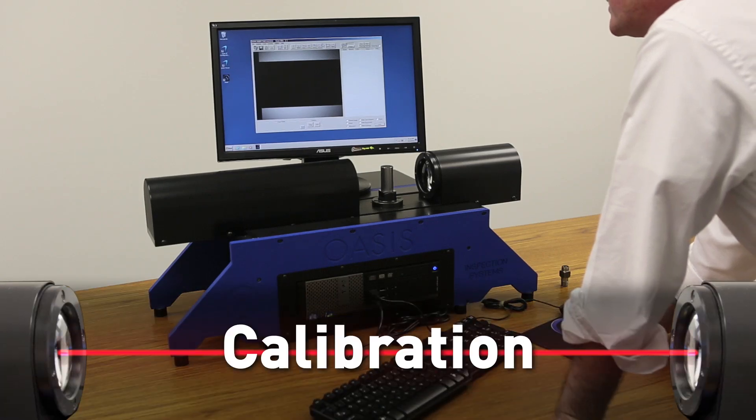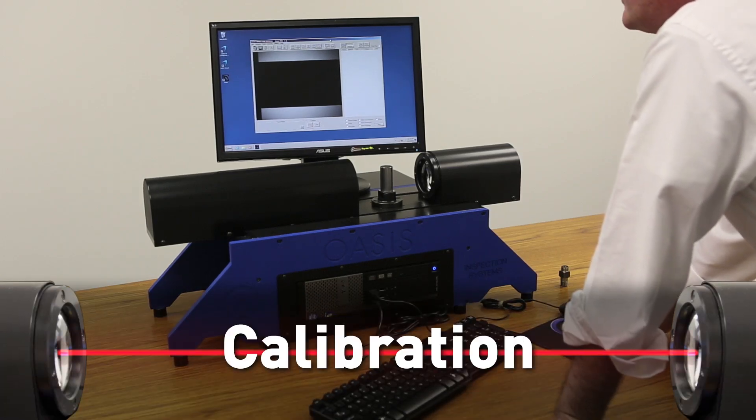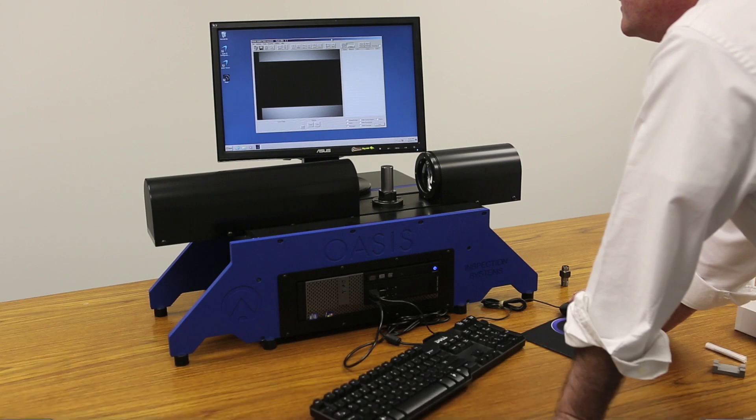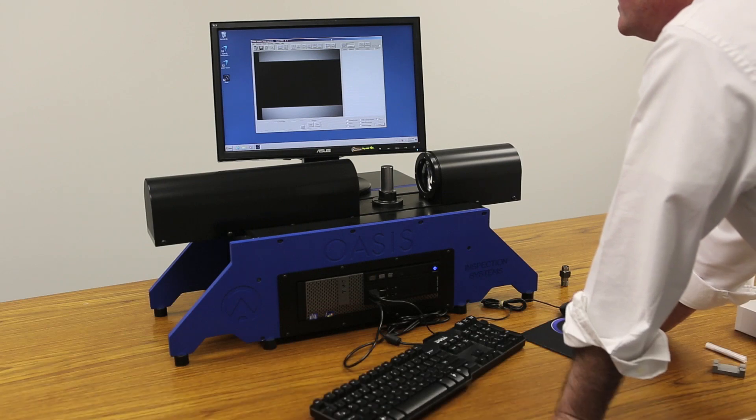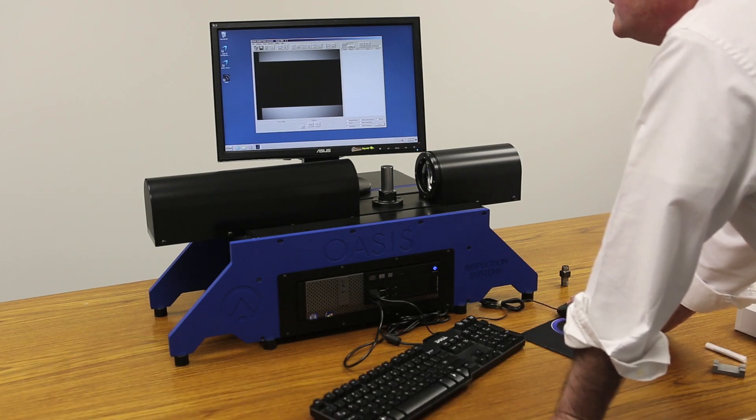We'll now show the procedure for calibrating the OASIS. The beauty of the OASIS is its simplicity and ease of use, and calibration is no different.